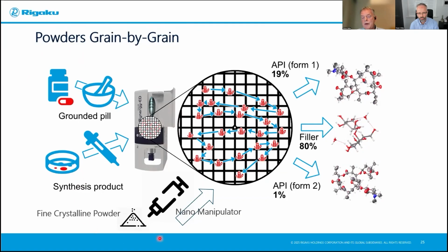And one thing I saw recently, which really surprised me, are these nano manipulators, where people are doing very targeted crystallization, making specific nanocrystals, and then they can pick them up and drop them on the grid in particular locations. So it becomes easier to characterize which experiment has led to which particular nanocrystal and how successful it's been.